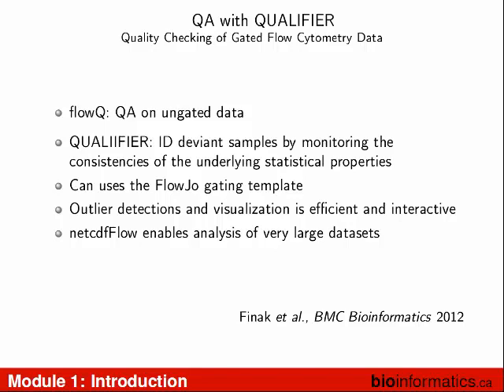One of the nice things that FlowJo has done is they have exposed how their stuff works through XML files. FlowJo writes a workspace, and that workspace is an XML file, and we can parse XML. We can parse anything, but we have to know what it is we're parsing. A company like BD has these DIVA workspaces. They don't tell anybody what's in that workspace. There's no place where BD has written down what's in the workspace and what each part means, so effort has to be spent to reverse engineer that. FlowJo doesn't tell anybody what they do either, and they change what they do, but it was much easier for us to reverse engineer that than other kinds of software.